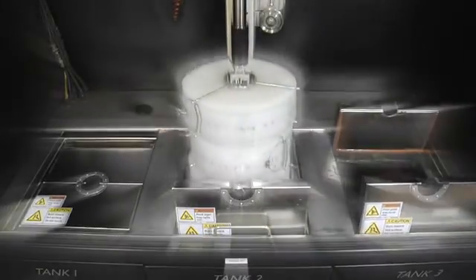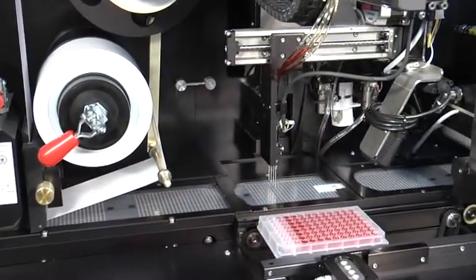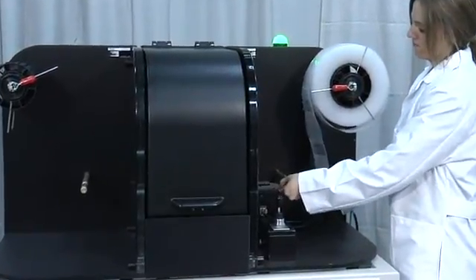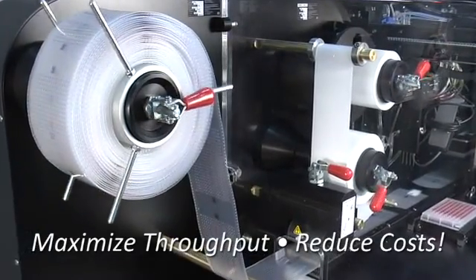The combination of the ArrayTape consumable, Nexar Liquid Handling and Assay Processing System, Solex PCR Thermal Cycler, and Arraya Scanning Instrumentation enables a complete reel-to-reel process flow to maximize throughput and reduce costs.